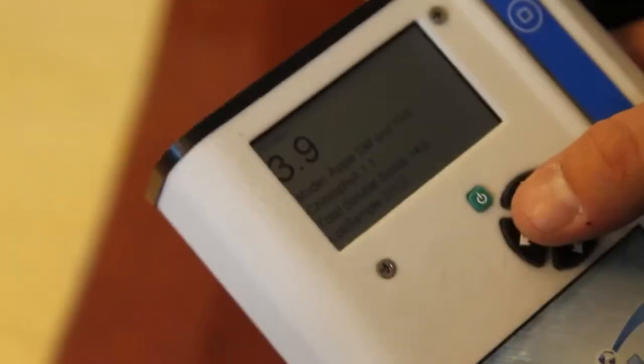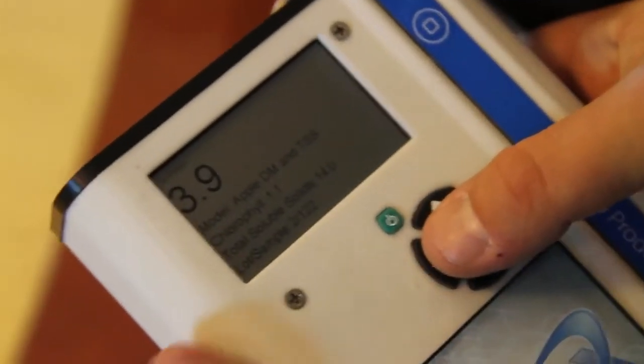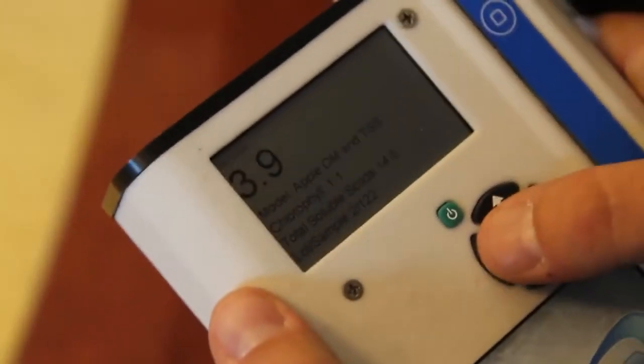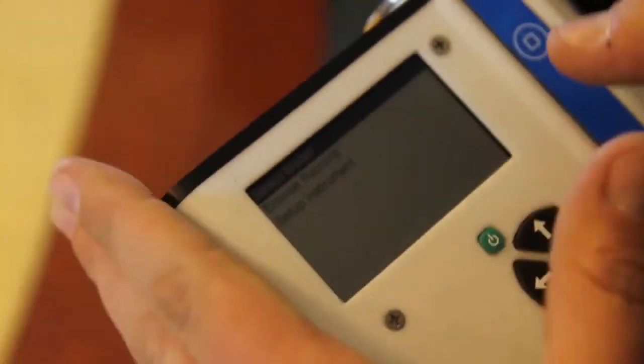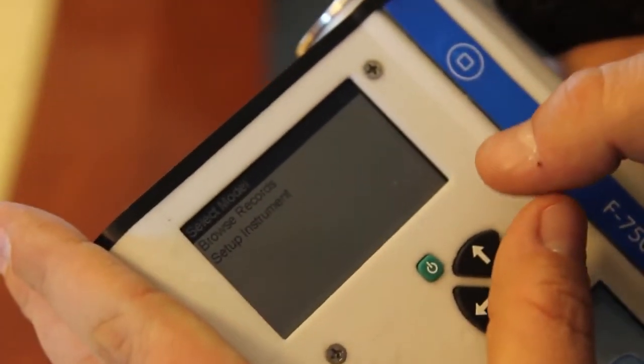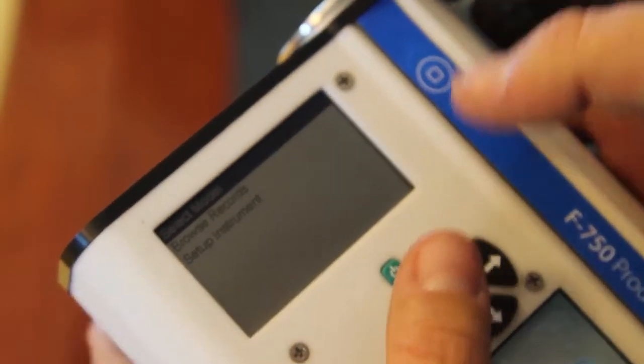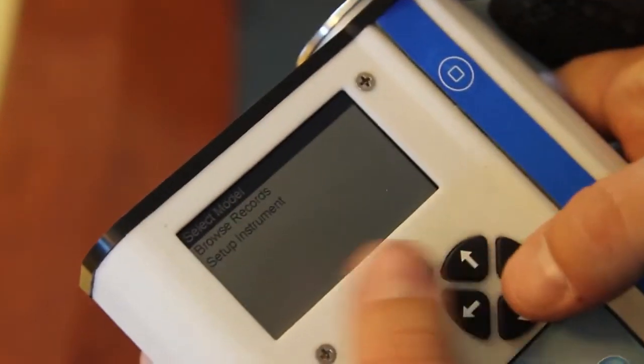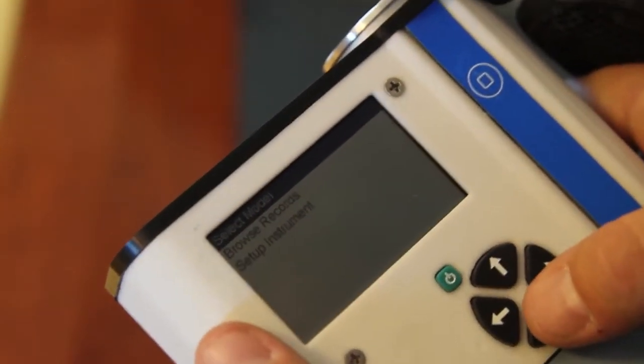So we've recorded three measurements. All of these have been stored in the device. Pressing any key leaves the screen that it shows you when it takes a measurement.